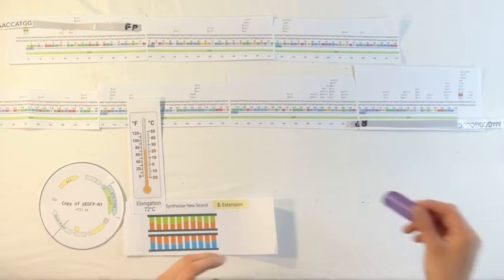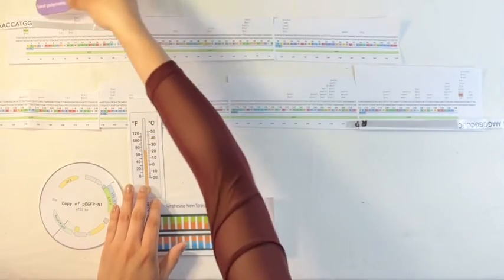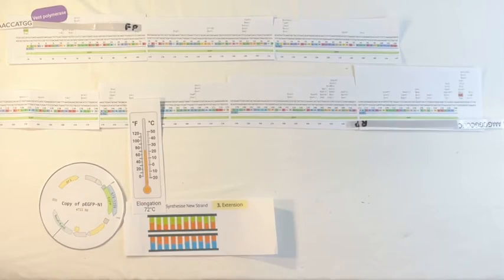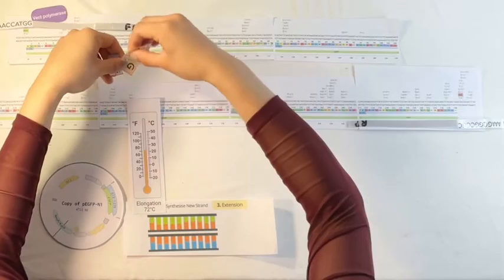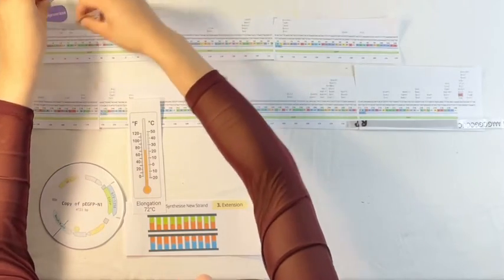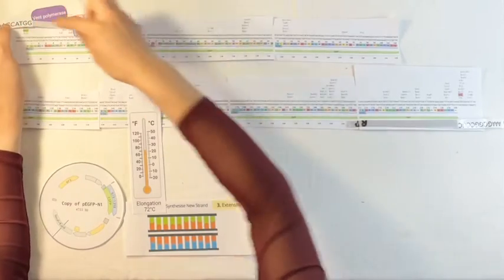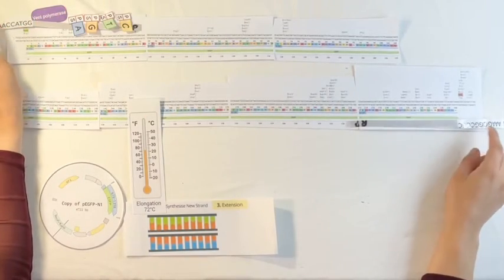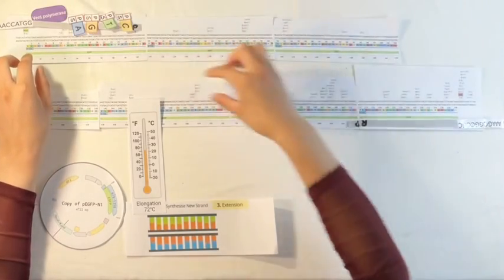During this process, this temperature is ideal for this enzyme known as vent polymerase to work. Vent polymerase is going to help assemble clones of this EGFP gene by running along between the sites of the primers, using DNTPs to build complementary segments.